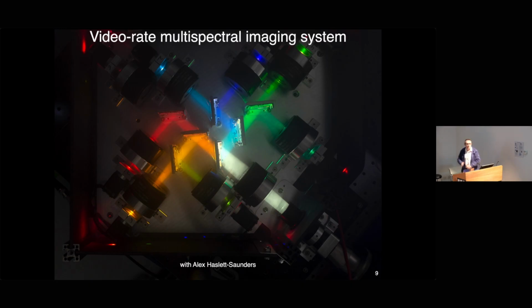And so now we've split up the whole spectrum into these 8 different channels, and because we're using dichroic mirrors rather than bandpass filters, we don't lose any light. Every photon that comes in here ends up on some camera somewhere, you just need to work out where that is. So now we can acquire the data at the rate of the parent instrument. So if you were going at 10 frames a second, you can go at 10 frames a second now, you just got to worry about 8 cameras rather than 1.